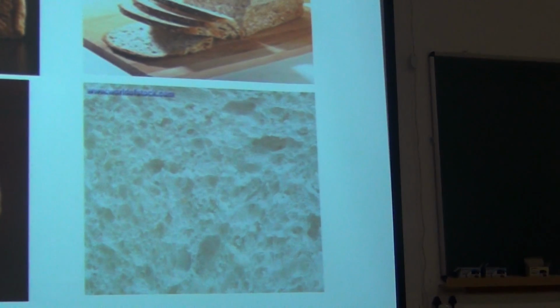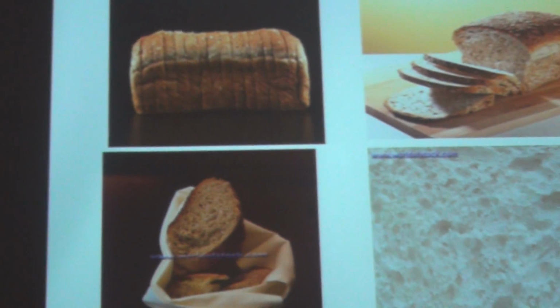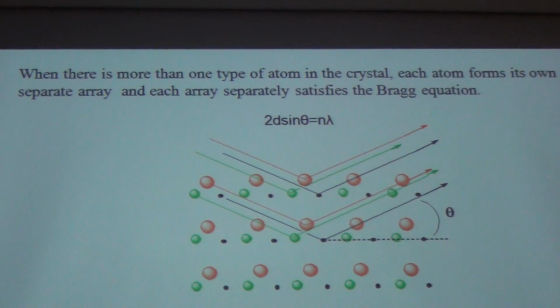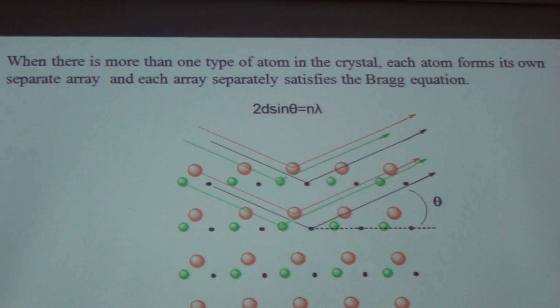So now we measure all these and then do the routine crystallography against it. Now, this is the logic of the whole thing. Whatever is happening in that slice is shown in this picture, and this is the one which utilizes Bragg's law.